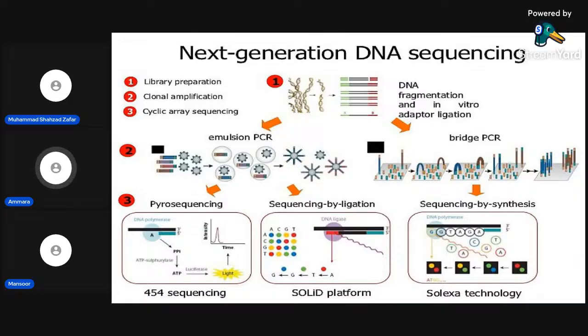So we were discussing pyrosequencing. In pyrosequencing, when our complementary nucleotide, that is dNTP, that can be adenine, guanine, cytosine, thymine, whatever is the complement of our template DNA fragment, when that dNTP binds to our template, light will illuminate in case of pyrosequencing. So we will detect that illumination of light by using a detector.